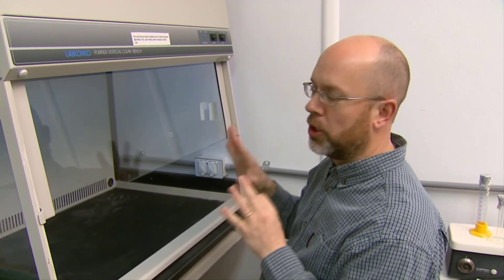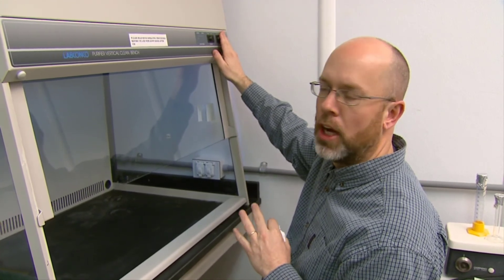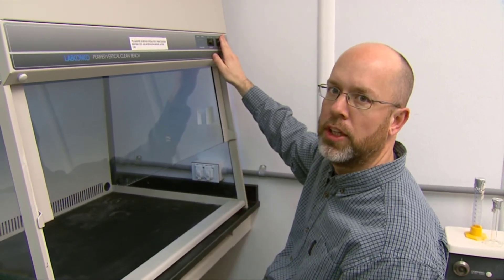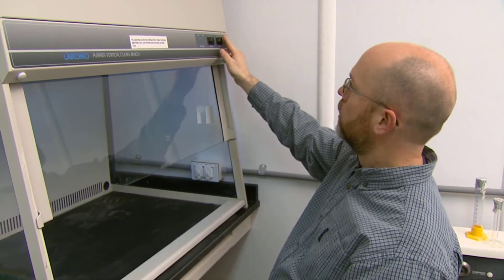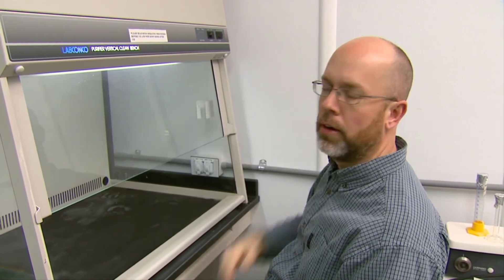After that 15 minutes, make sure you turn the UV light off, because it's not good to either look into the UV or work under UV light. Switch the UV to off, and the other option is just a regular fluorescent light.